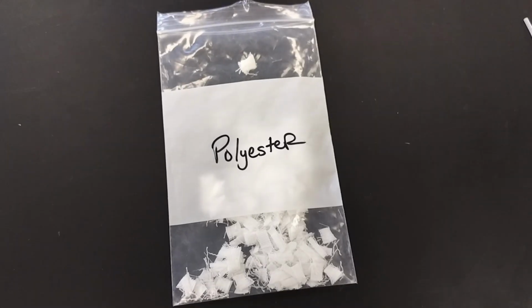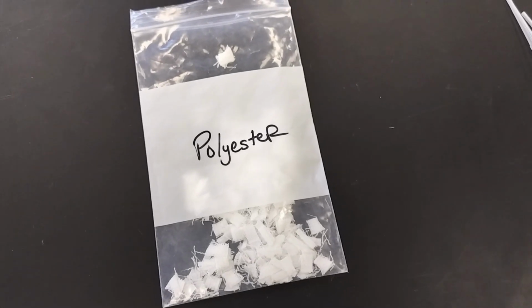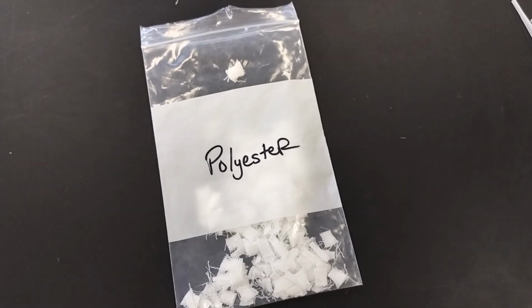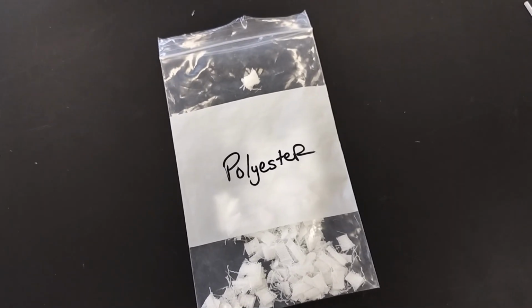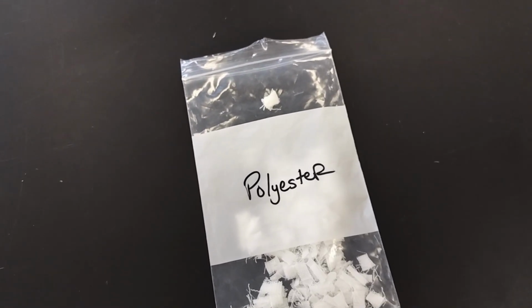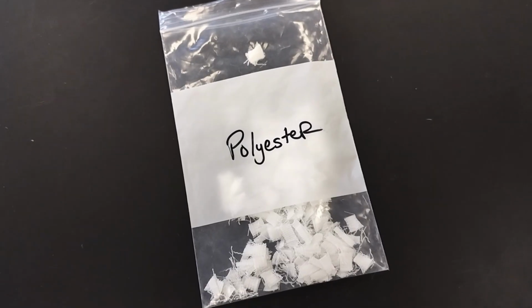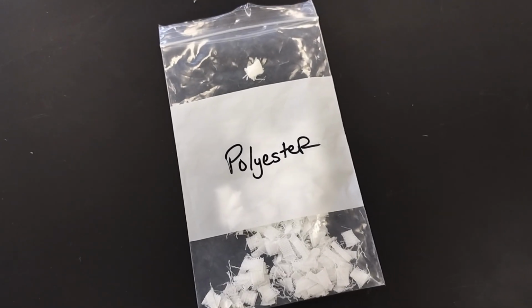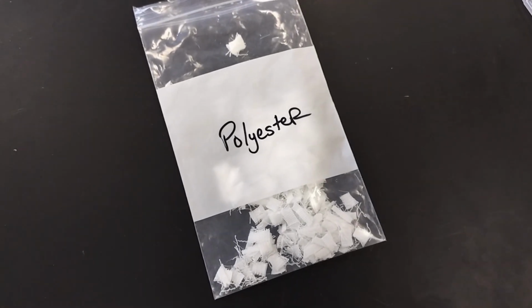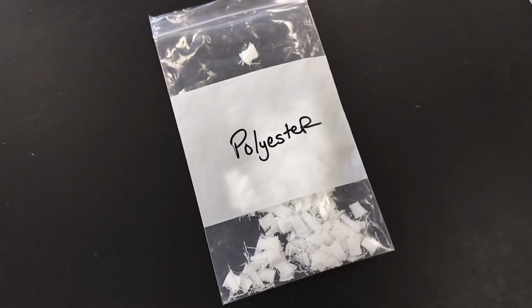Now we are going to test another fiber. After visual inspection, burning test, and microscope observation, if you narrow down that the sample is synthetic, chemical testing is used to confirm the exact fiber type. For this demonstration, let's assume we don't yet know the fiber name, but we are confident that it belongs to the man-made or synthetic fiber group.